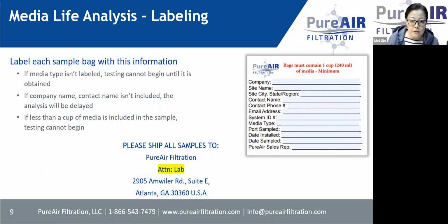So for sample labeling, you will see a sample on the right side with company information, at least contact information, and the media type, and the system ID, or when you sampled, when the system is installed. That's a very good information.